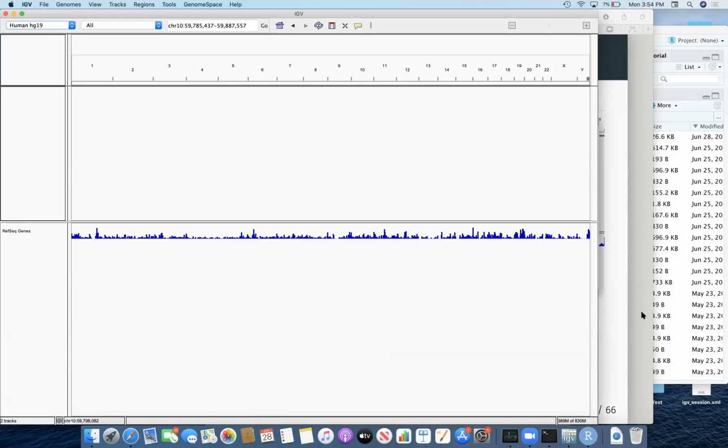Is it fun to load different types of files, bed, bigwig, in IGV when making a figure from IGV? Yeah, absolutely. I would hope so. You want your bed, you want your bigwig side by side. And then you can arrange them as you like. And we're going to get a bit more into that now as we go on.